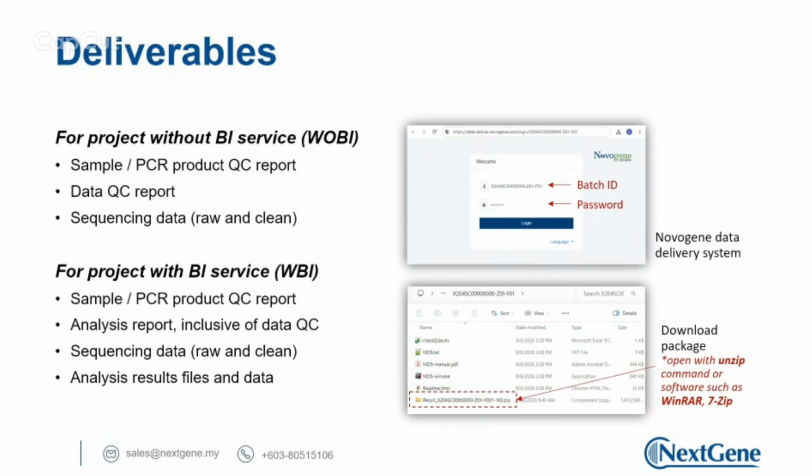To make it easier for the user, they zip all the results into a zip file, so you just need to download one single zip file. But the caveat is that when the project involves a lot of samples, the file size could be quite big, so it might take some time to download. Once we download the files like this, let me show you how it looks.